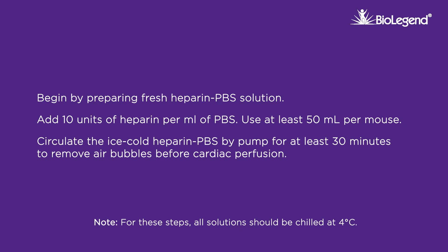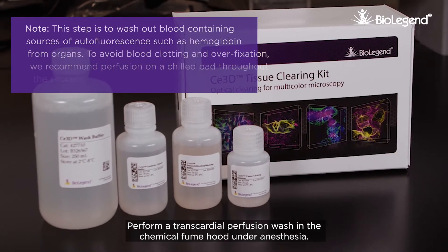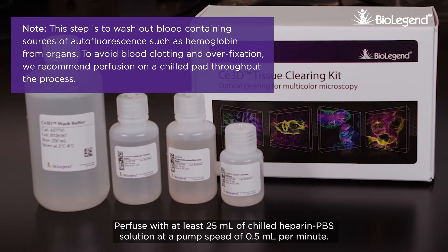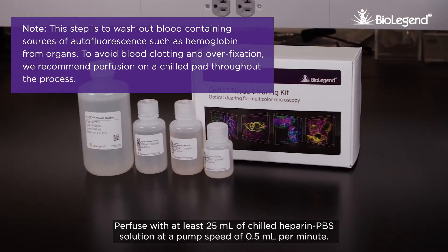Circulate the ice-cold heparin PBS by pump for at least 30 minutes to remove air bubbles before cardiac perfusion. Perform a transcardial perfusion wash in the chemical fume hood under anesthesia. Perfuse with at least 25 milliliters of chilled heparin PBS solution at a pump speed of 0.5 milliliters per minute.